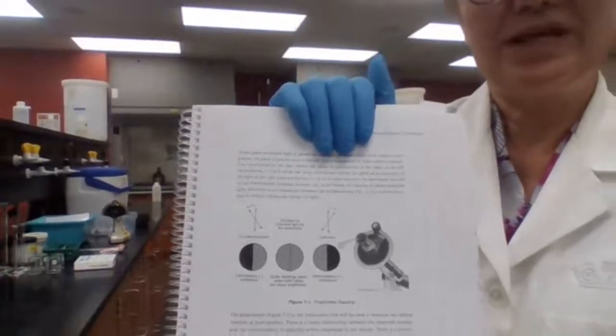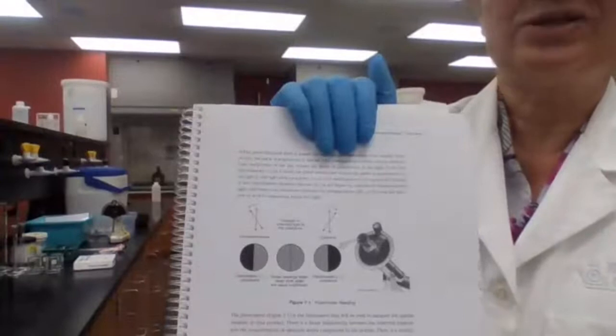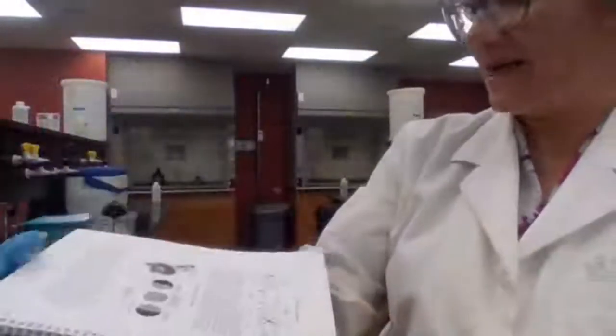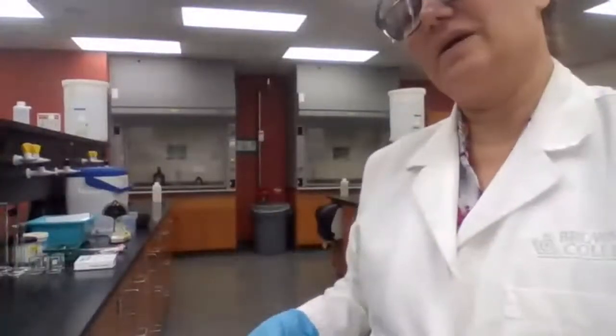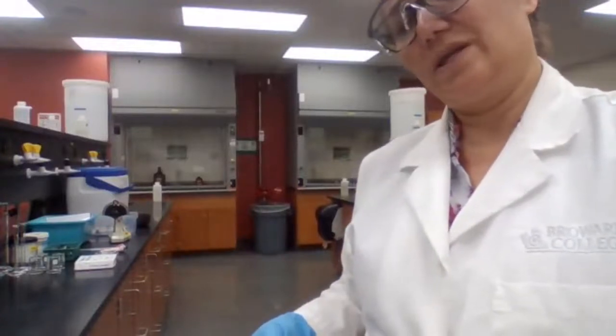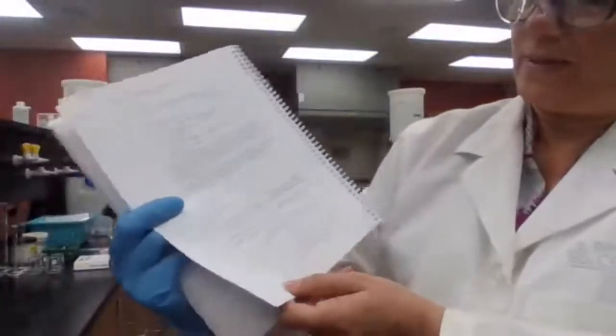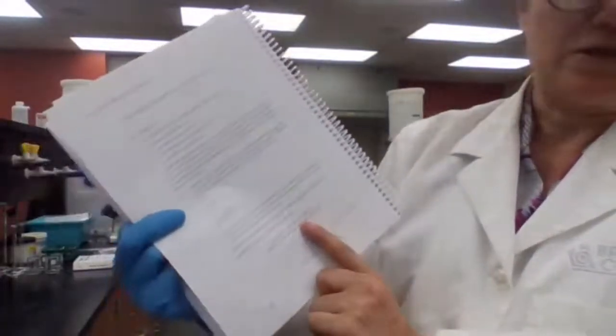If the specific rotation of the product matches 100% with the specific rotation of the pure S enantiomer, the value is given here in page 88: 40.3. That's the specific rotation.